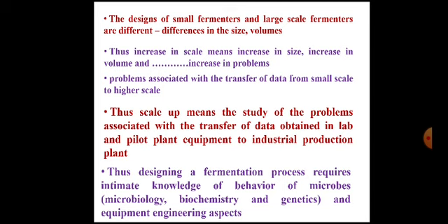Along with these biological aspects, fermentation technologists must have the knowledge of the equipment engineering aspect. That means he or she should have knowledge of fermenter design. He should have knowledge of the components and working of different parts of a fermenter.